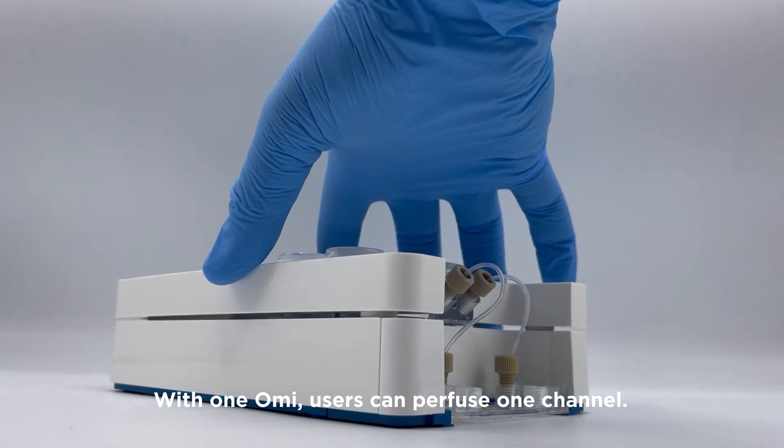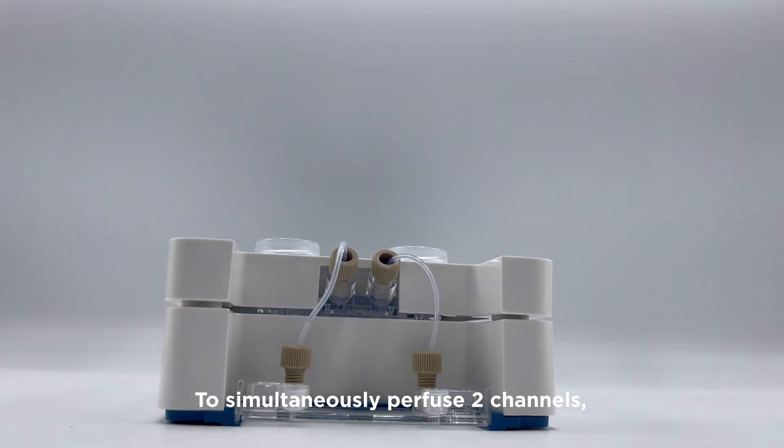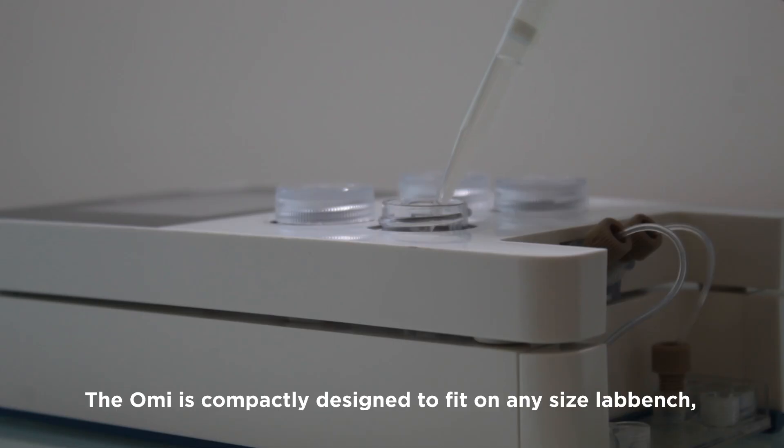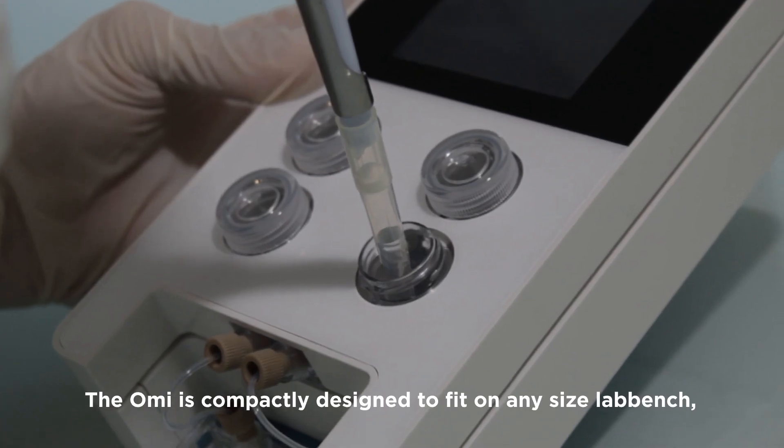With one OMI, users can perfuse one channel. To simultaneously perfuse two channels, simply combine two OMI devices.